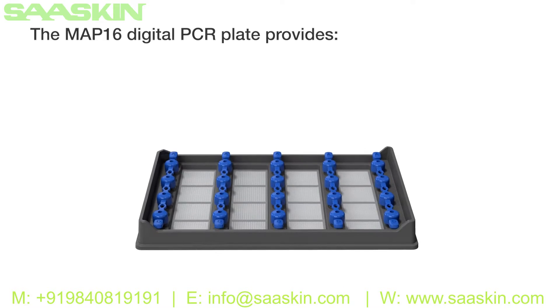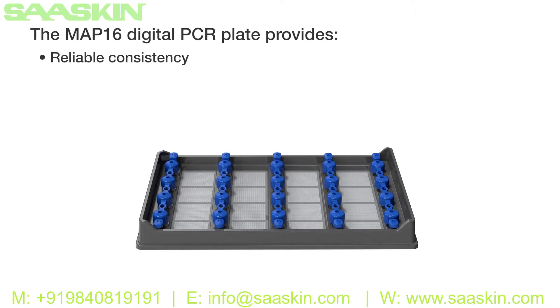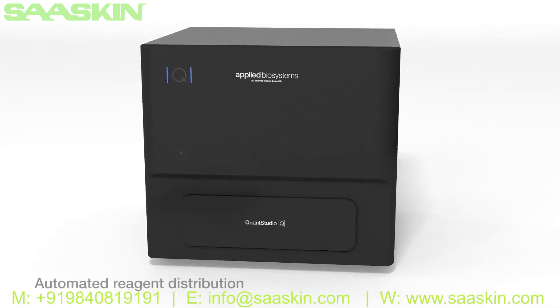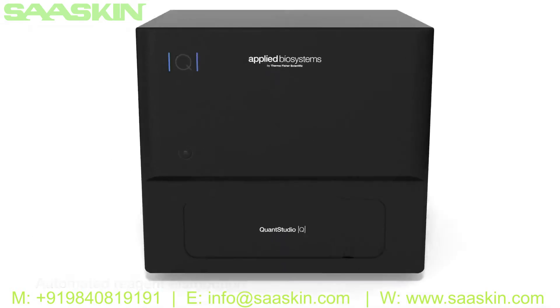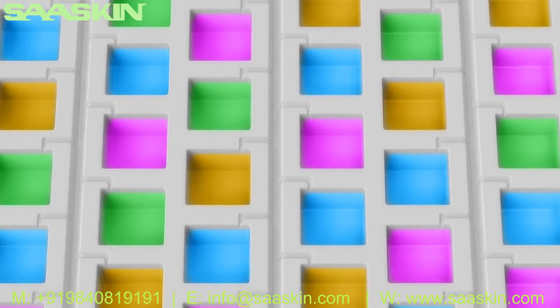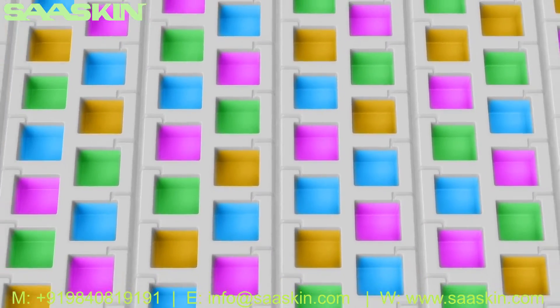The MAP16 digital PCR plate provides reliable consistency, high accuracy, and an easy workflow. After loading your sample into the plate, the instrument performs automated reagent distribution into fixed microchambers. Each reaction remains independent during thermal cycling.